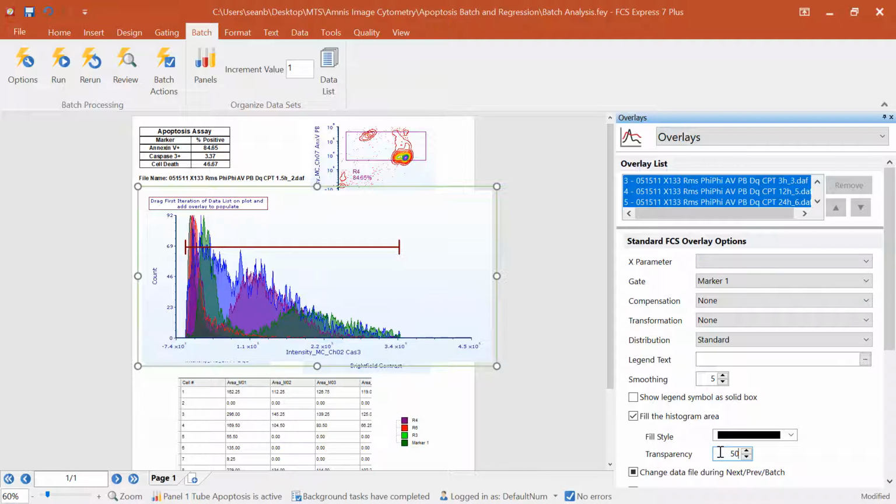And when you do this, you can really accomplish and create any sort of visualization of these overlays and of the data that you want. You're going to get real-time displays of what these changes will do when you're working in our formatting dialog. So again, if you don't want to fill it, take the fill out, right? There's a lot of different options here that you can do. But again, you end up with this high resolution graphic that was quickly and easily created.